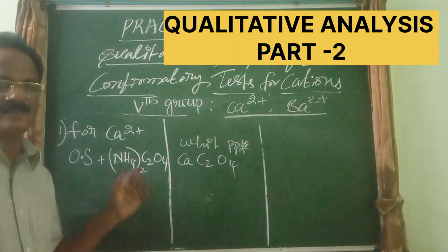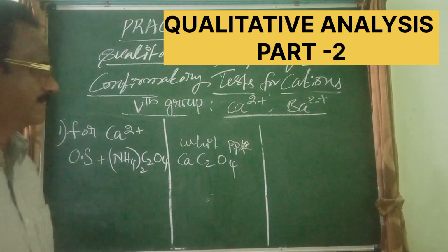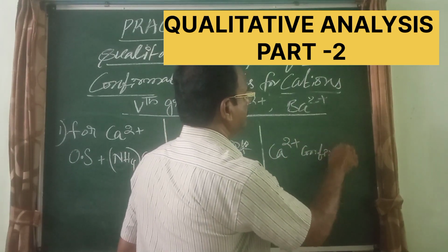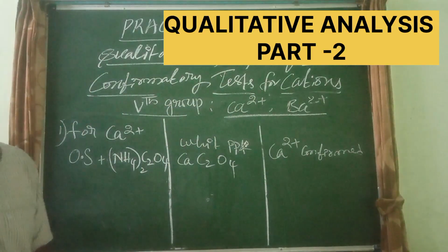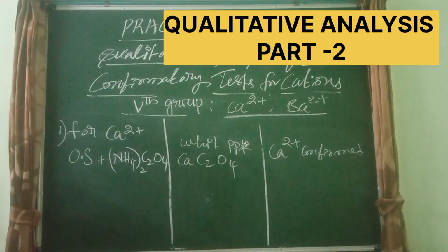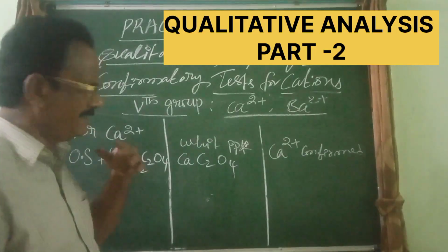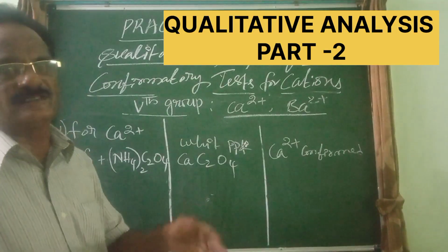See here what is happening. The ammonium is replaced by calcium. Calcium oxalate, Ca2+ confirmed. Okay. So now let us see, we have to check in another step also before confirming the presence of Ca2+.